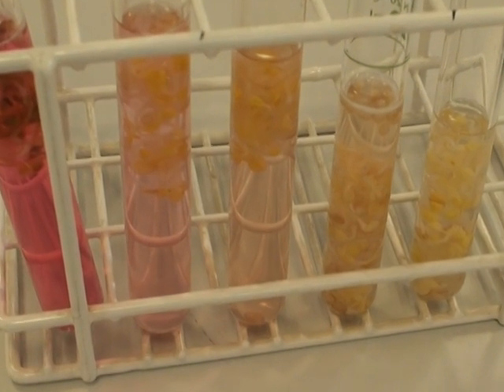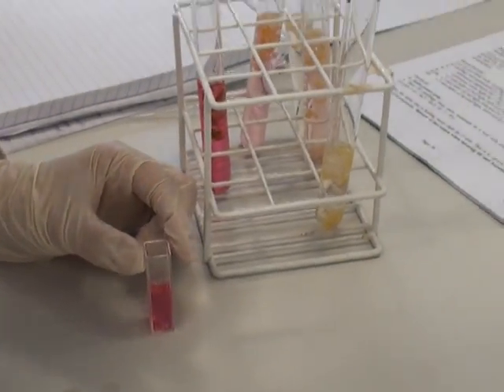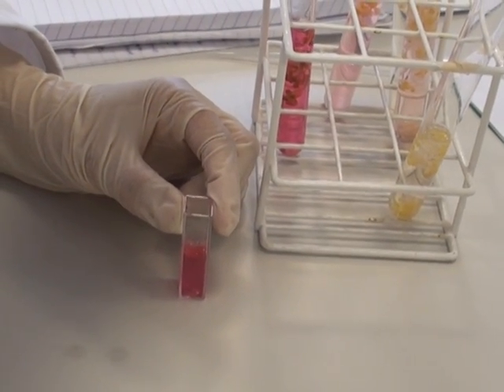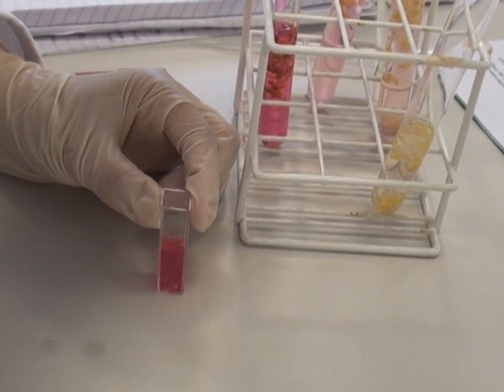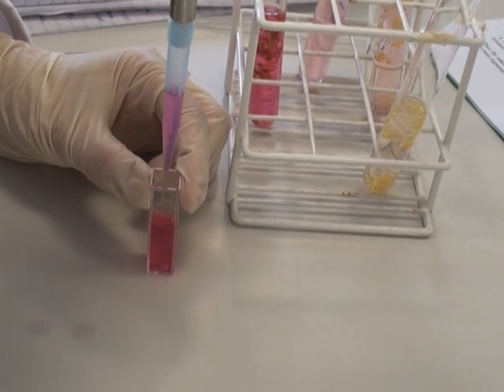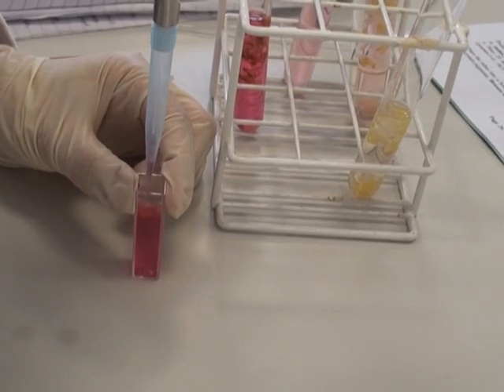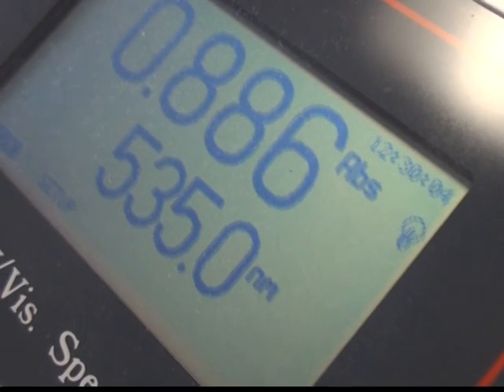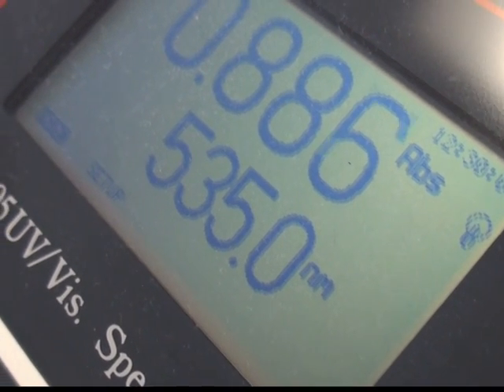After extraction, the tubes look like this with different amounts of the red anthocyanin pigment extracted in the different treatments. These are then put into a spectrophotometer cuvette with a fixed path length and the absorbance of the pigment is measured in the spectrophotometer at 535 nanometers, the maximum absorbance of the anthocyanin pigment. Here we can see that the reading at this wavelength is 0.886 absorbance units.